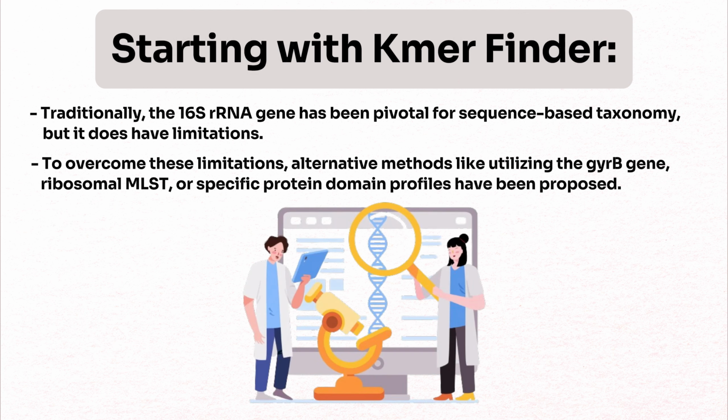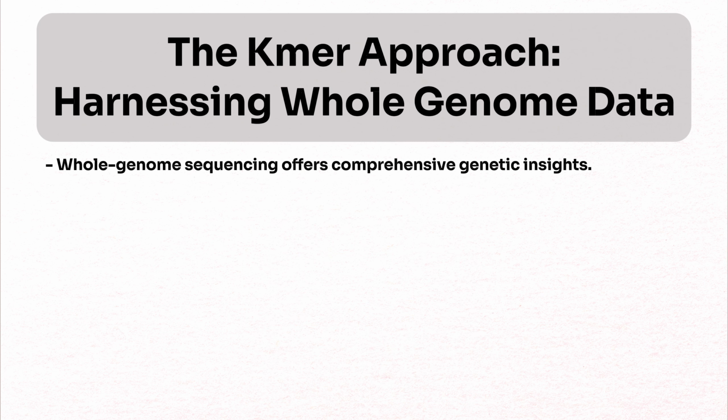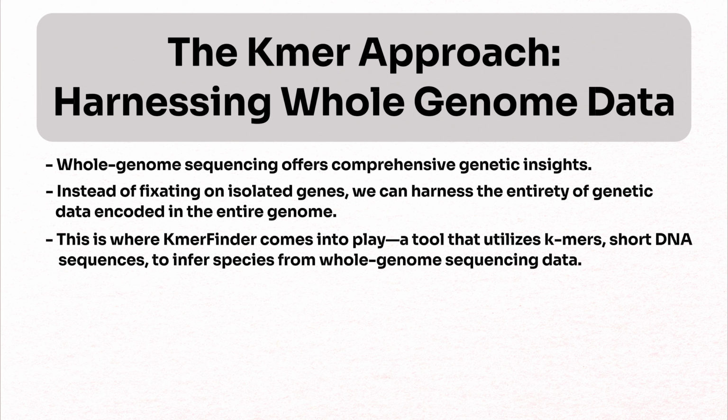The Kmer approach, harnessing whole genome data. Whole genome sequencing offers comprehensive genetic insights. Instead of fixating on isolated genes, we can harness the entirety of genetic data encoded in the entire genome. This is where Kmer Finder comes into play, a tool that utilizes Kmers, short DNA sequences, to infer species from whole genome sequencing data. Understanding Kmers.